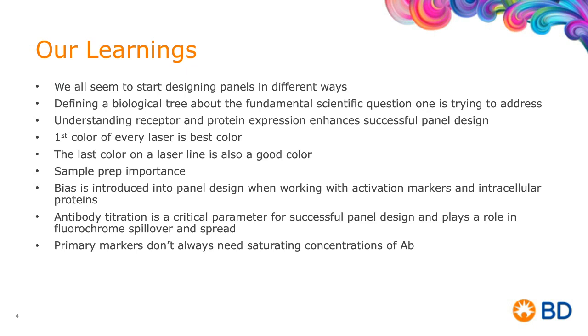I think for all of us too, we recognize that the first color on each of our lasers is really our best. And that goes for cross-laser excitation and spread and spillover. And we're going to go through this because there's a story on every laser line.